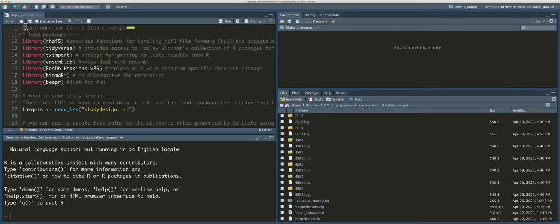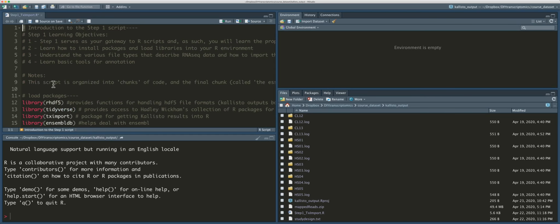If we were to just paste in a Western blot image, like we would paste in code, and not annotate it with comments, not write in our lab notebook what we did, how we interpret it, and what the lanes of this Western blot that the gel was run with represent, then it really lacks context and becomes really hard to interpret for anyone else, even for yourself down the road. So you're doing yourself a favor by adding lots of comments, and you're certainly doing everyone else a favor.